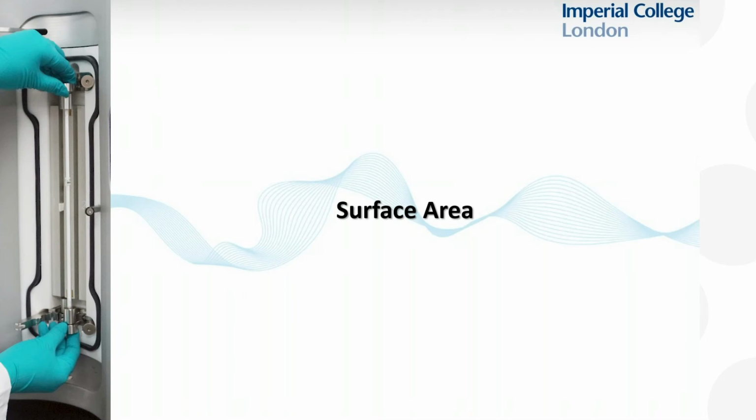But after that, we tend to have very little information. And one of the problems we often have when dealing with manufacturing problems and batch-to-batch variabilities in materials is that we don't have the right types of particle information to understand what the problems are. So we might have lots of bulk information in terms of infrared spectroscopy and maybe SEM, but often that information isn't of sufficient value to help us understand some of the occasions where particles don't behave the way we hope.